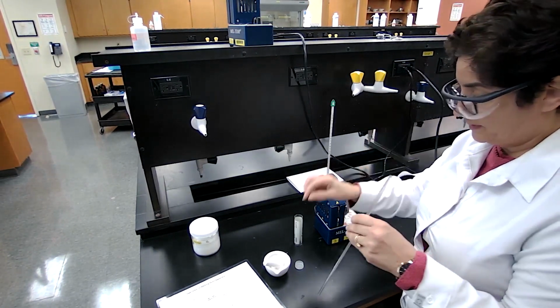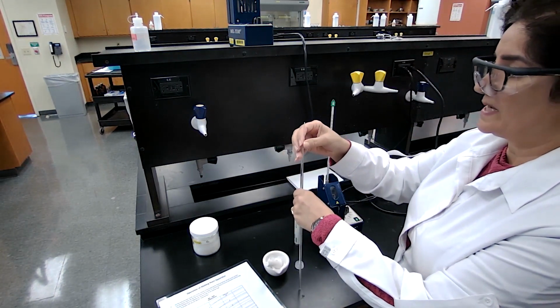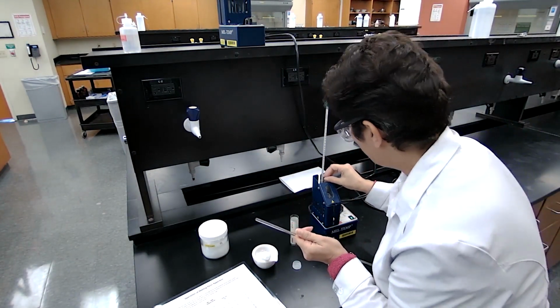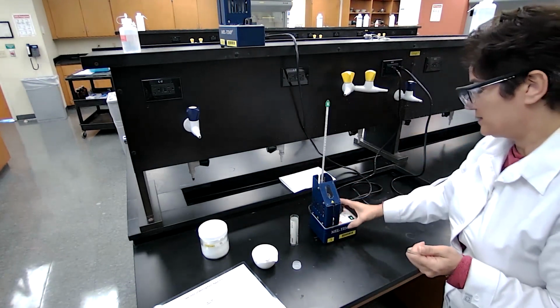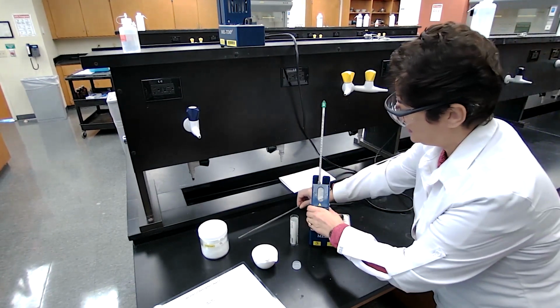I'm going to prepare my new sample with the second sample to test the melting point. We place the capillary tube in and the machine is on, with the setting at less than 2, like 1.8, and wait for the melting.